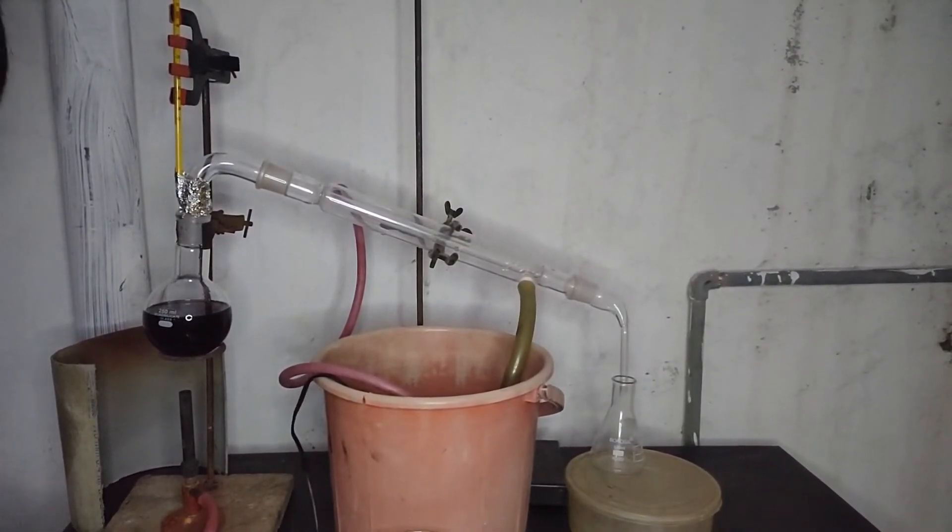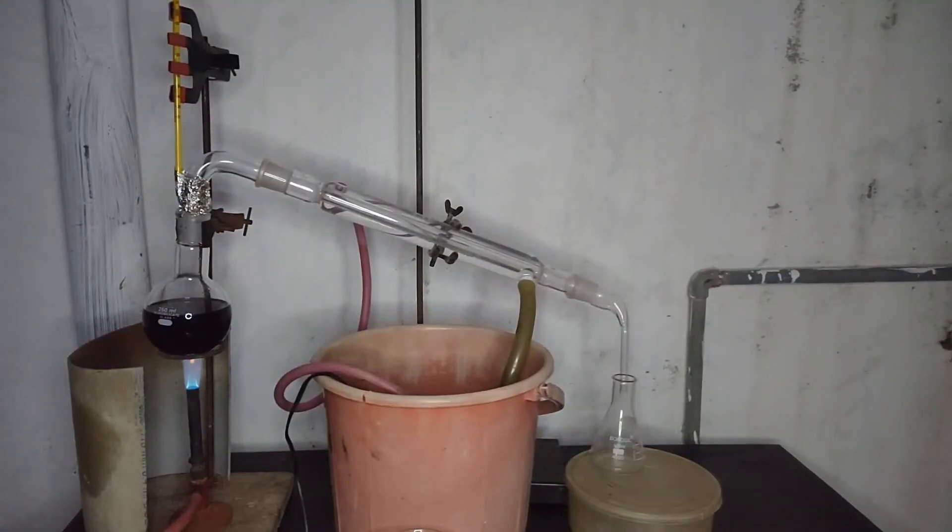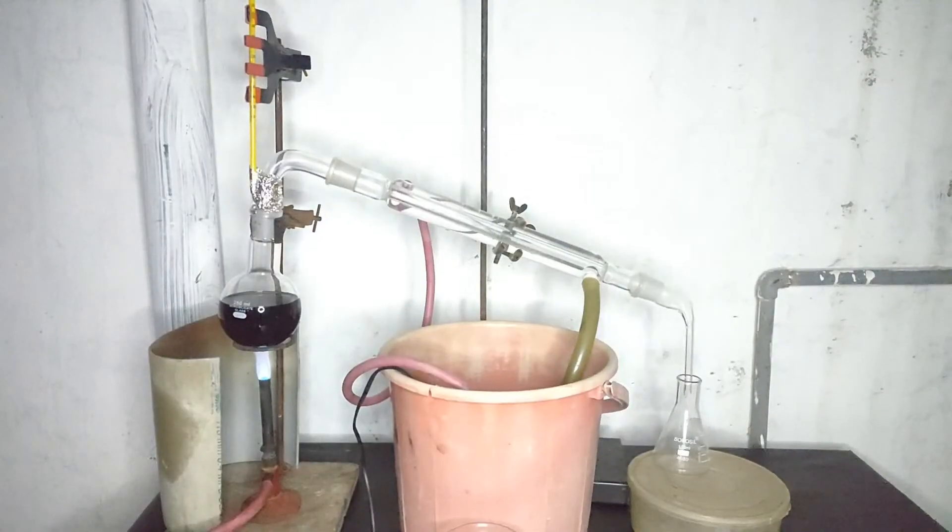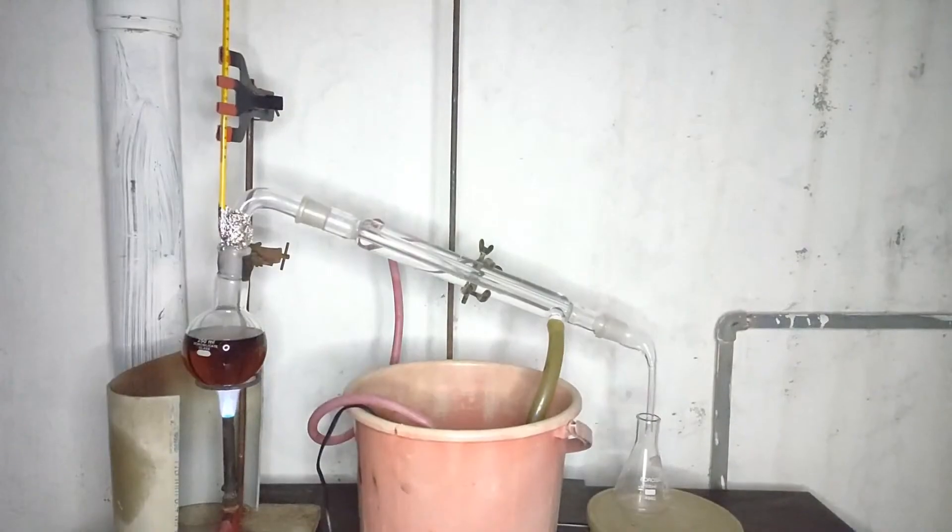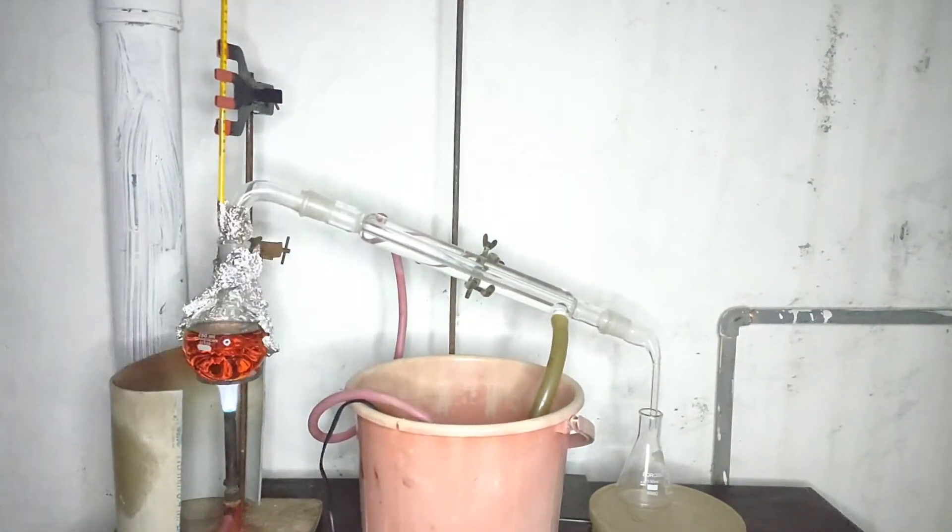Water was circulated in the condenser and burner was lit and its flame was adjusted. I insulated the flask with aluminum foil so that the vapors can make up to the top and the color of the sulfuric acid has lightened up.